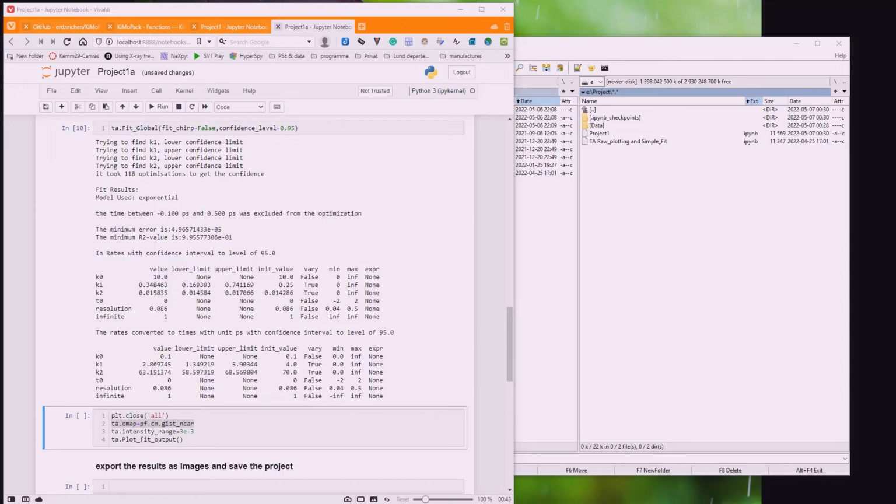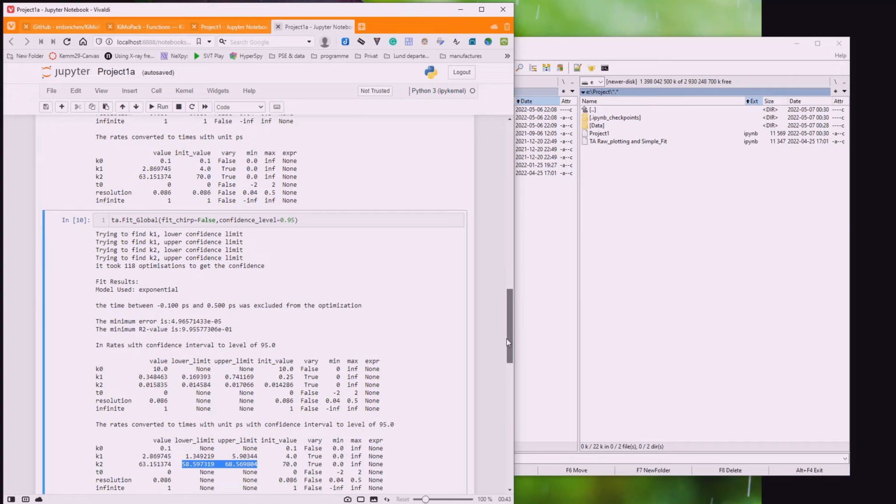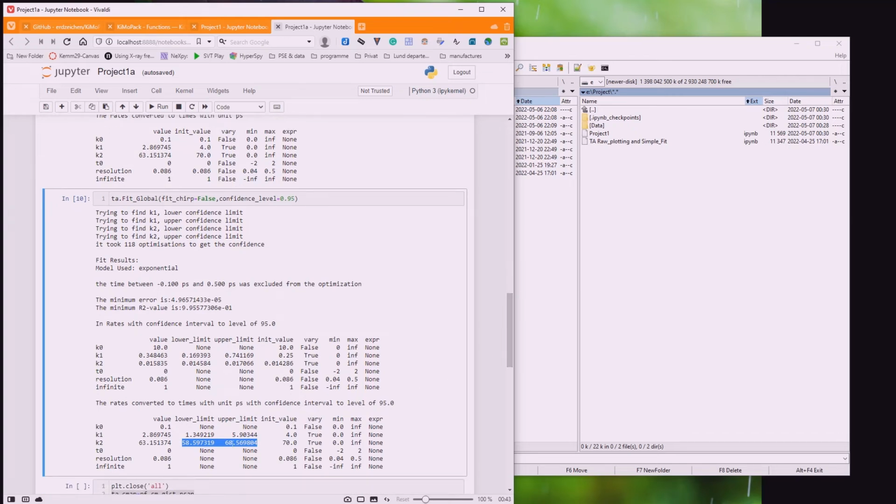This optimization goes relatively fast, and we see that, for example, for each of the two parameters we have calculated the limits within which the statistics tells us it can go. I didn't set any limits before, so this could go really freely everywhere, and you can see that some of those values are relatively well confined, but it is still a relatively large range. So the model we have is okay, but maybe not good and could be worked on more.